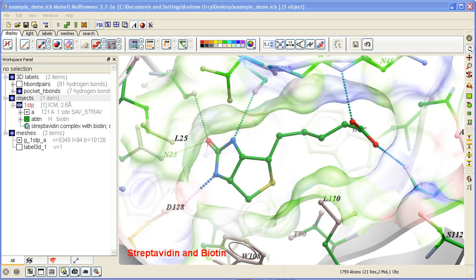How to display or undisplay hydrogen atoms. Hydrogens will only be displayed if you've converted the PDB file into an ICM object. You can tell whether an ICM object has been converted by checking for 'ICM' next to the name of the PDB file in the ICM workspace.